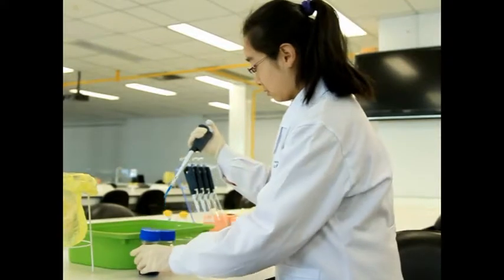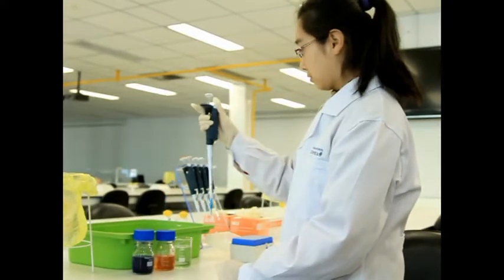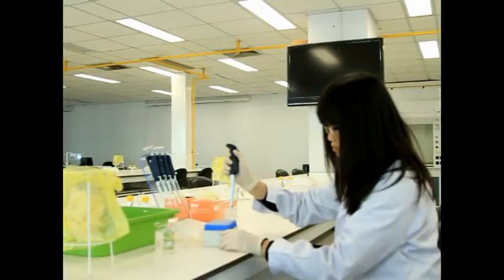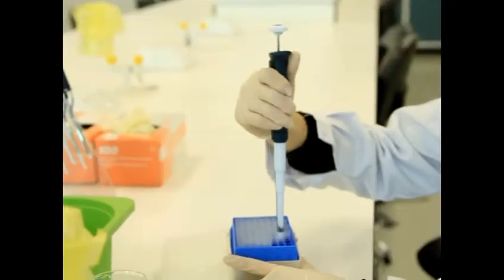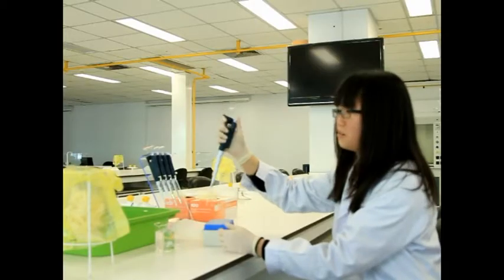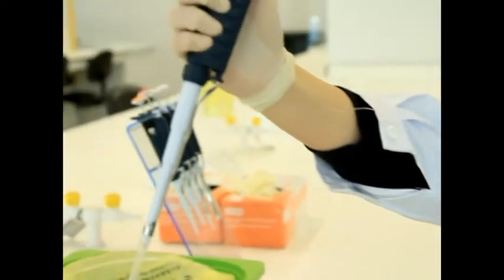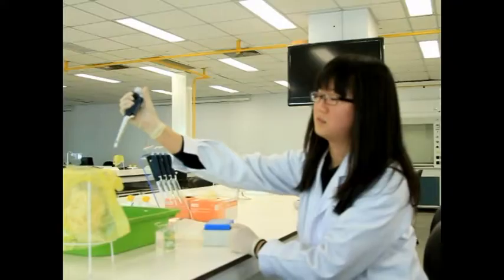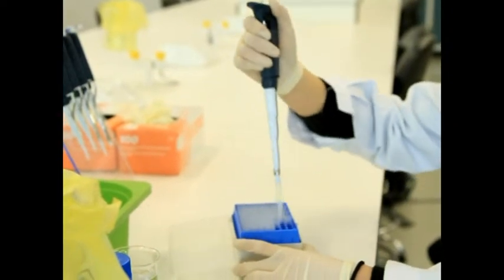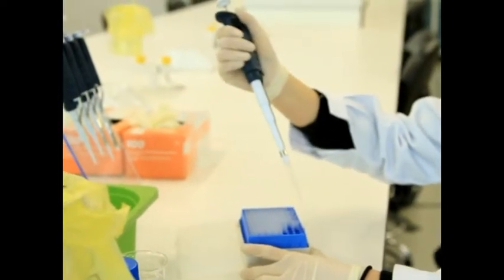You should keep your pipette mostly vertical to prevent liquids from running up the inside of the shaft of the pipette and into the dispenser. Press the pipette shaft down onto a new tip with a rotating motion so the point is well sealed to keep it from leaking. When finished, you can press down the eject button to eject the tip. Be careful not to stab the pipette into anything, since it will likely damage the pipette and impair its accuracy.